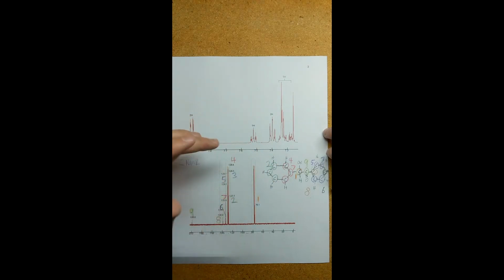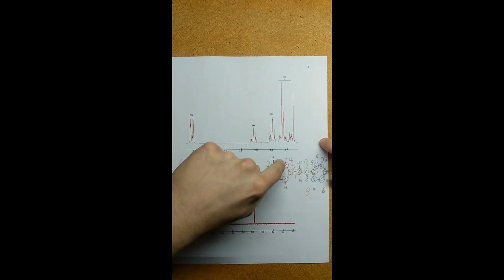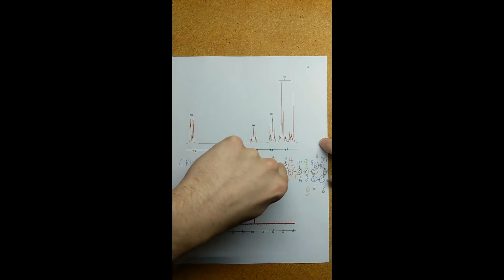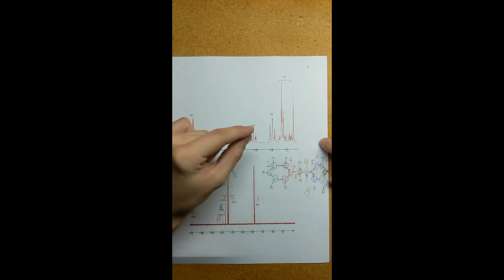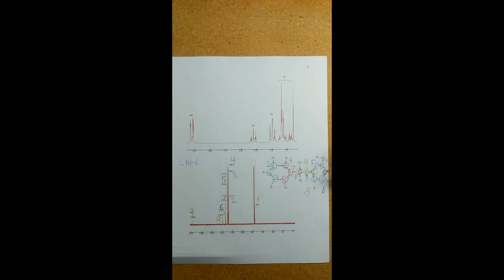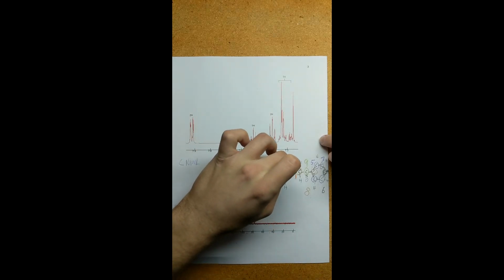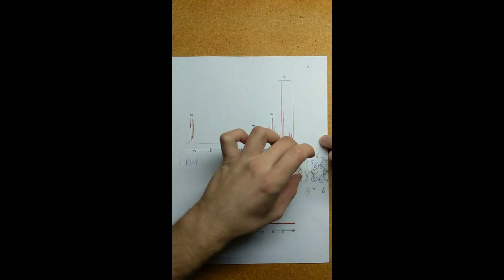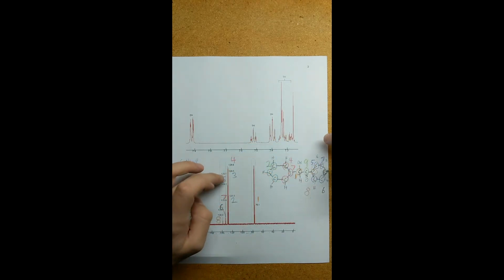Moving on to 4, the fourth least deshielded, 128.6, just slightly more. I chose these 2 carbons right here. Again, I grouped them together because they're in similar environments, and I have them being a little bit more deshielded just because they are not on the outside of a ring structure, they are on the inside, which does put them slightly closer to an electronegative oxygen.